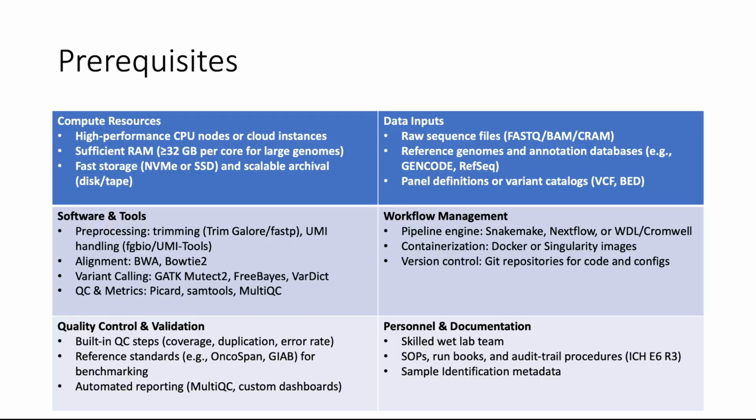Also, we need tools to align these reads with our reference genome. In the next stages, we'll need variant calling packages and packages for metrics and quality control.